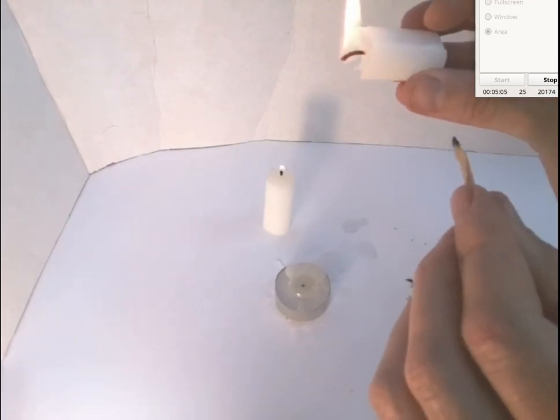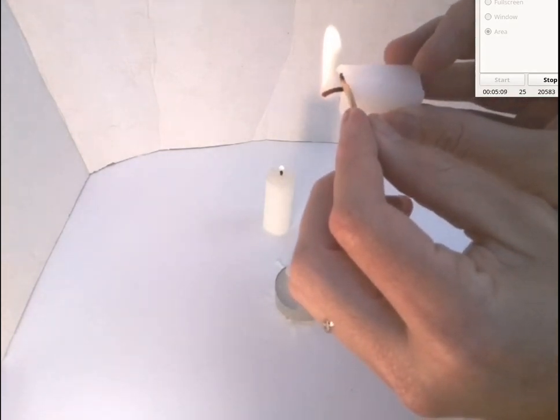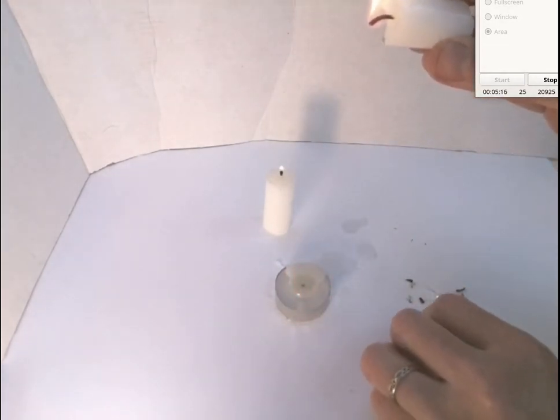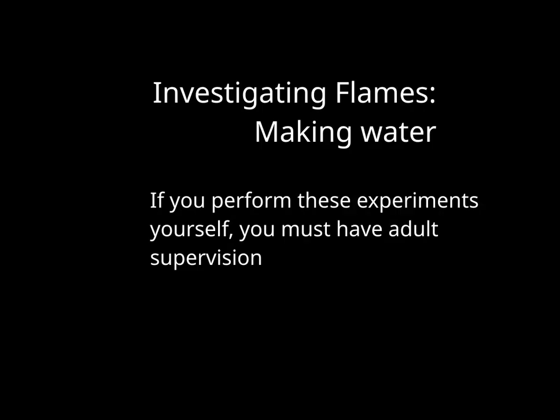you'll see that it goes black, and when you pull it away, it's gotten sufficiently hot that as soon as you remove it, you can see that it's alight because there's the classic yellow flame with the glowing carbon particles making the yellow flame. Wooden splint.